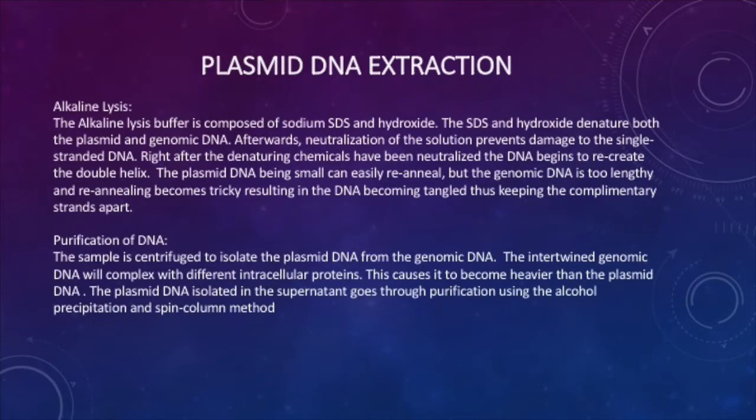Plasmid DNA extraction. Alkaline lysis. The alkaline lysis buffer is composed of sodium dodecyl sulfate (SDS) and sodium hydroxide. The SDS and hydroxide denature both the plasmid and genomic DNA. Afterwards, neutralization of the solution prevents damage to the single-stranded DNA.